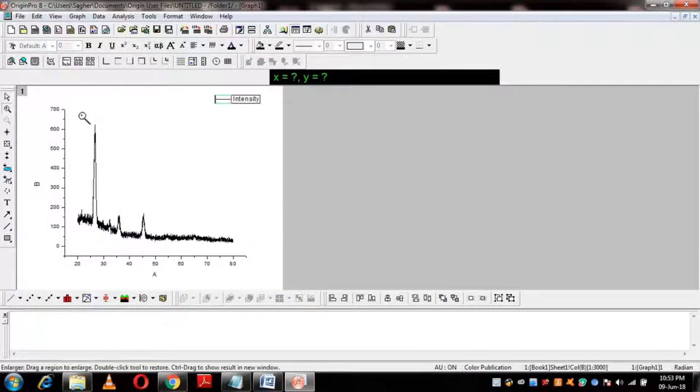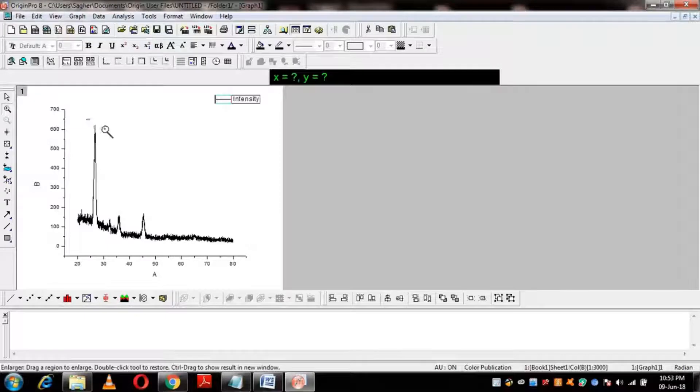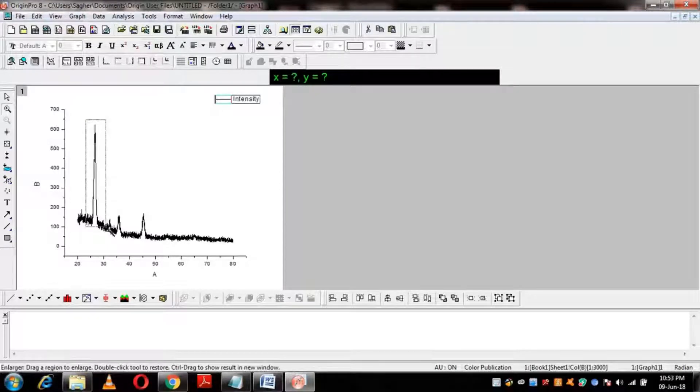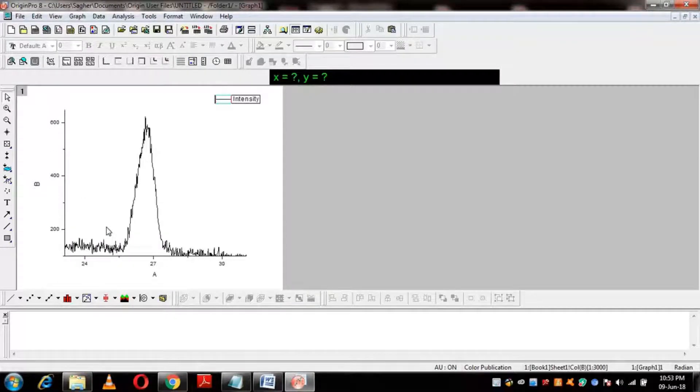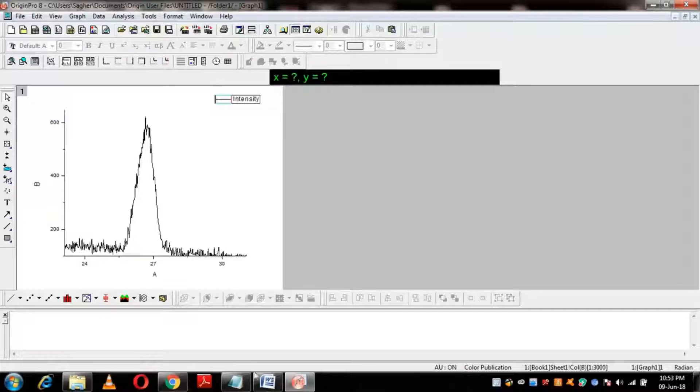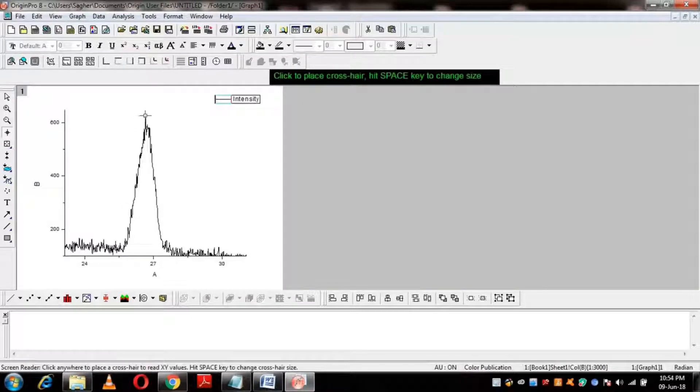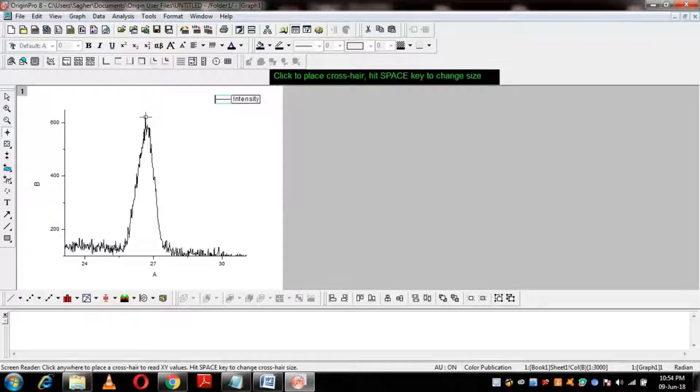Step 1: Select the desired peak. Step 2: Find the full maximum or height of the peak.